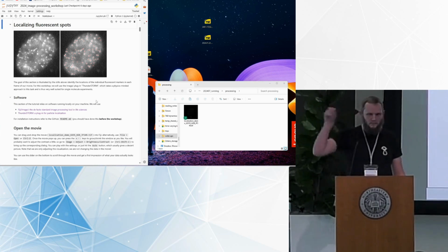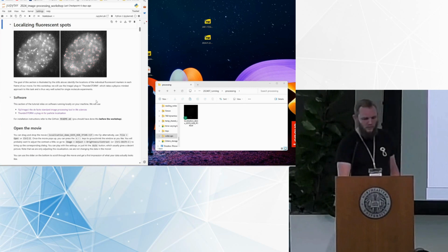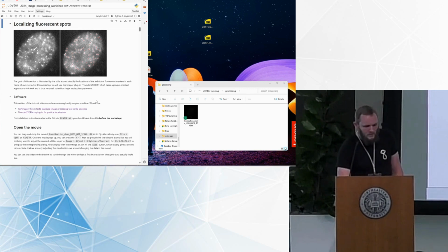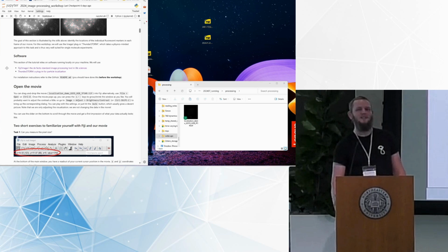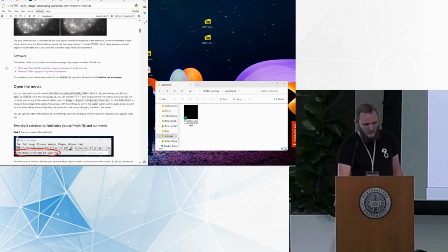We want to find the fluorescent spots in our movie. The software we're going to use, I hope everyone has installed, is Fiji. Can I get a quick show of hands of who has worked with Fiji before? Okay, that's many. That's cool. So we can do the intro relatively quickly.